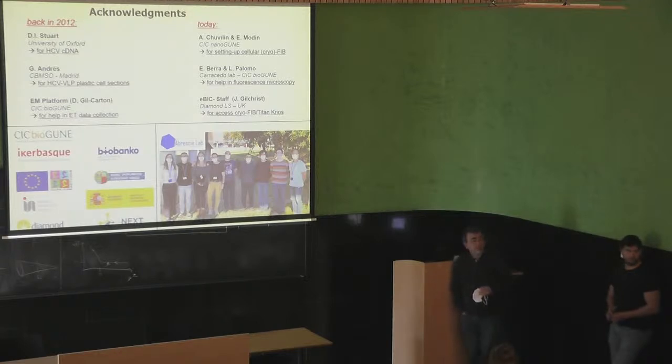Yeah, I was also very concerned about this, because as Zhenya told, the focus is significantly worse for xenon, just because of the size of the primary source. That's why we went for demos, and most demos didn't have any problem to make it. Also, it's just related to the amount of systems. The gallium systems are nearly everywhere, and these xenon systems are way more expensive. They're new and expensive. So probably we're breaking new ground. Exactly. Maybe it goes south, but at least we're trying something new here.